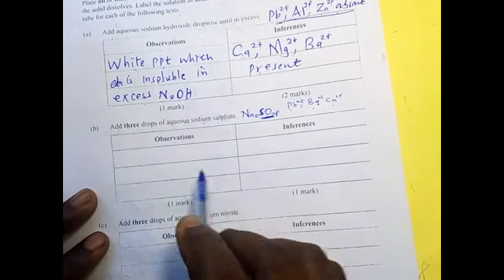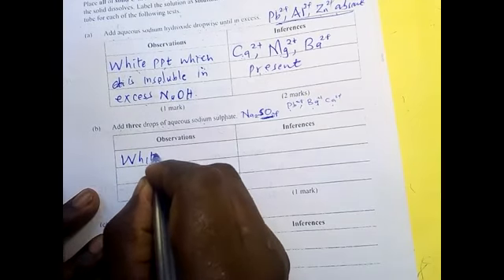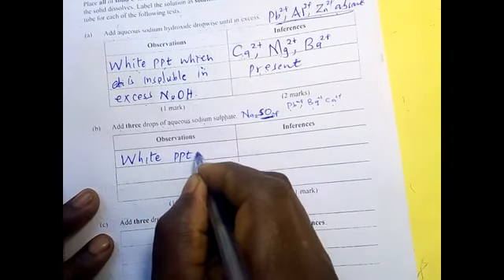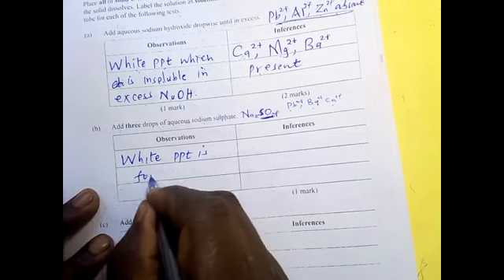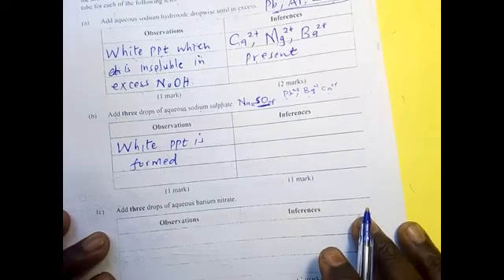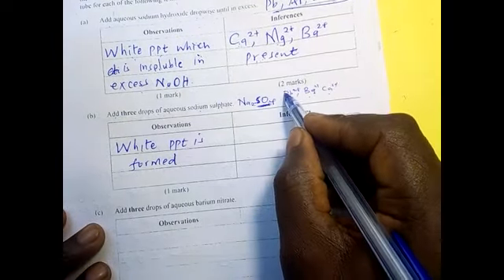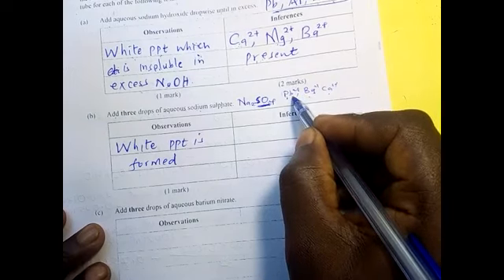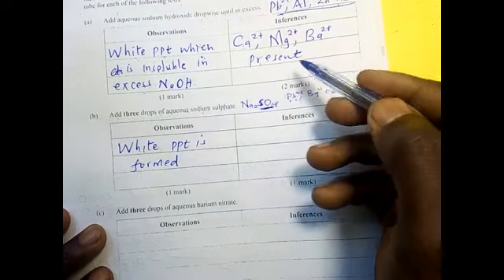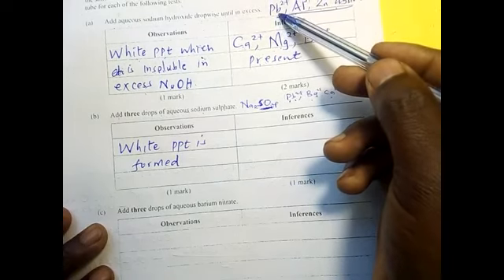So what was the observation for this one? A white precipitate is formed. If you put that lead is present, then you are contradicting yourself, because in our previous inference we said lead is not there.